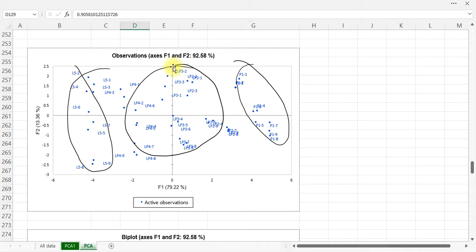It's similar to our DA, but this time it is not a very good display, because we don't teach the system, we don't tell the system what we want to look at. This is unsupervised, but the pattern is still the same.